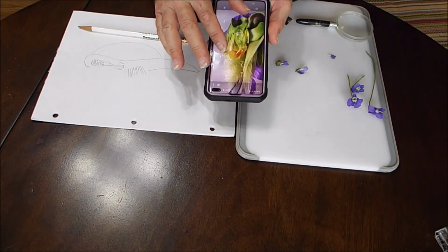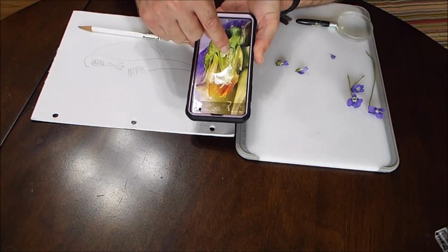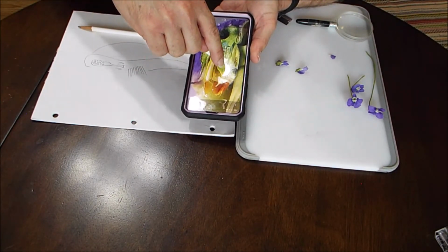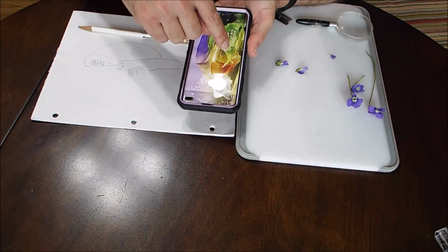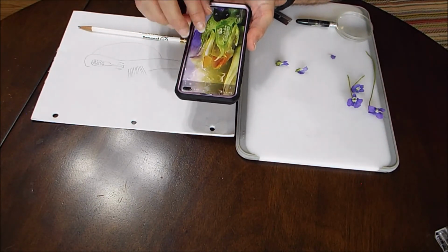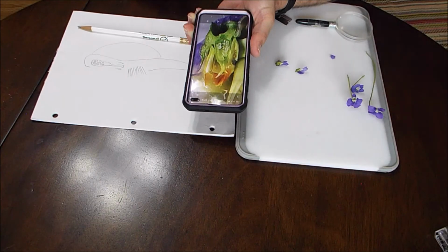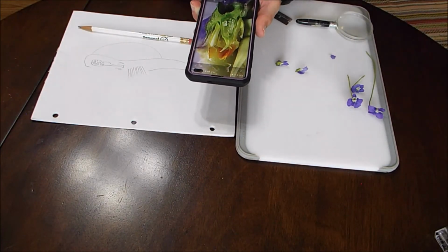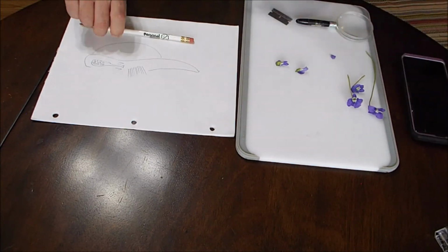Oh, look at those beautiful ovules in there. Oh yeah, baby. Those are the ovules, those little doohickeys right there. And then you can see the style, and the stigma might be on the other half. I think it got chopped off, but it's definitely there. So, hey, it works. So you can do the macro mode on your phone camera, and it acts just like a magnifying glass. So there we have the major parts of our plant.